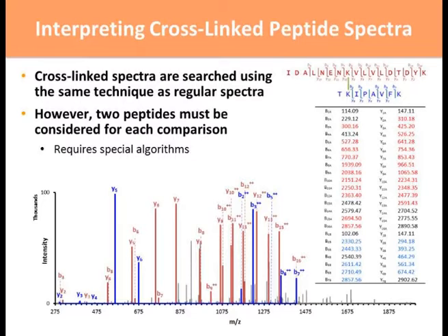that are computed from this have a unique characteristic in that if we step along this red peptide here at the top, the one that starts IDA, and we compute the B and Y ion masses, that's down here, they go along computing just as I had shown on day 1 with the addition of each amino acid mass until you get to this B8 ion, which is this lysine here, where now every B ion is the mass of all the amino acids plus the entire mass of the other peptide. And the same is true along the Y ion series.